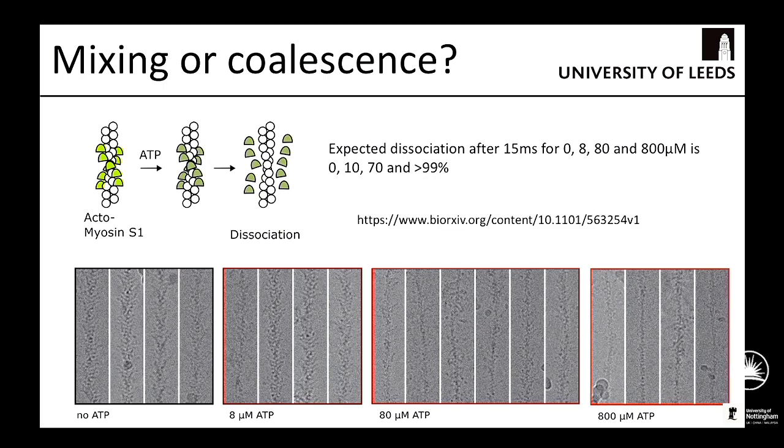For anyone interested in more details, we've put this on bioRxiv, so if you want to know a bit more about this system and how it's set up, please do check it out there. I would add as well that we don't own any IP on this, and we don't really intend to, so if anyone wants to make their own system, there are designs out there. Please do come and visit us in Leeds if you want to see how to build one of these yourself. Using John's philosophy, they're not cheap, but they're certainly cheaper than other systems out there, and you can buy a lot of this stuff off the shelf, put it together, and then develop it yourselves for other applications that you might want.